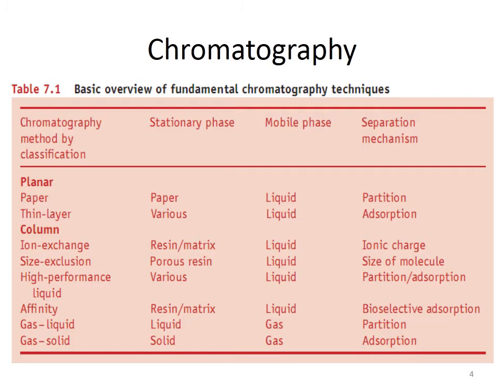And then gas chromatography is a type of chromatography in which the mobile phase is a gas. Generally, gas chromatography is used for either volatile substances, which could be easily converted into a gas phase, or molecules which have a small molecular mass.